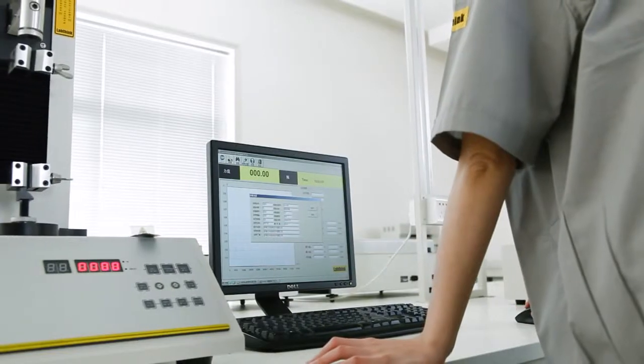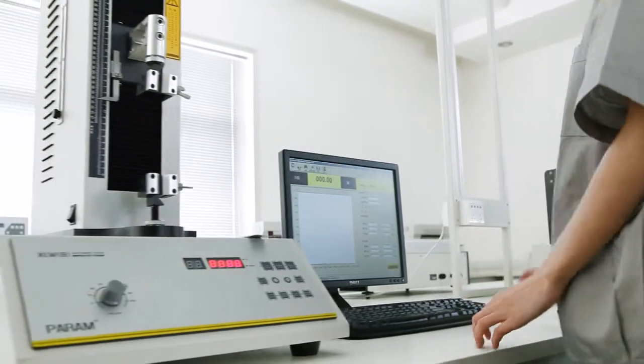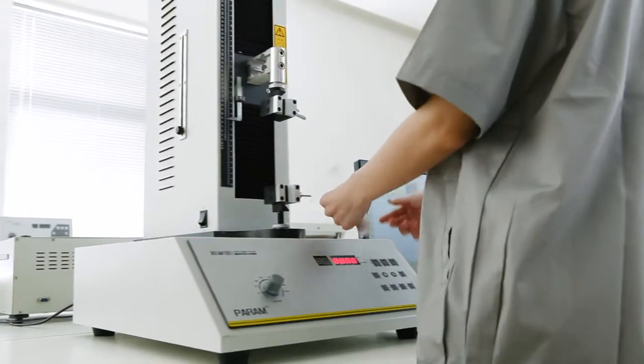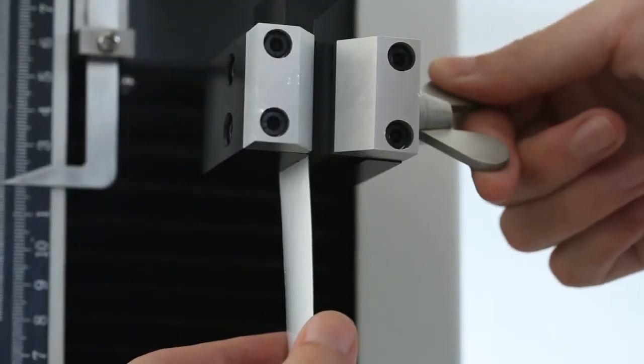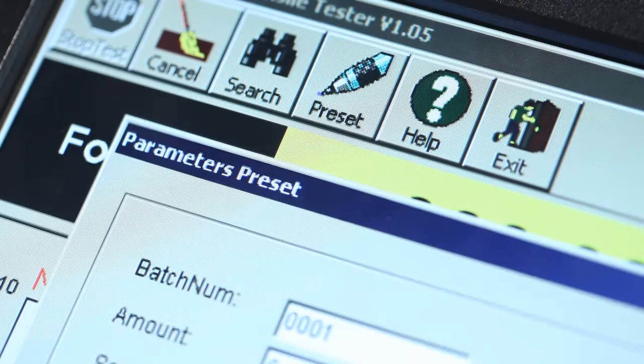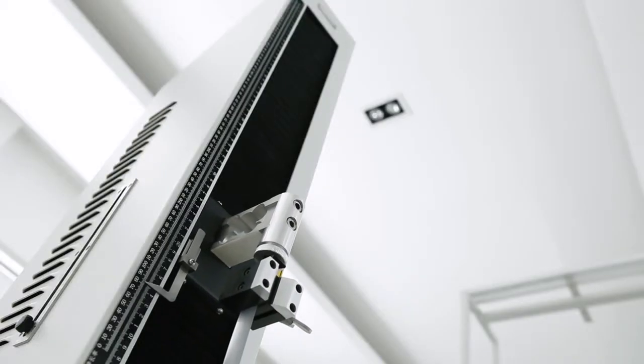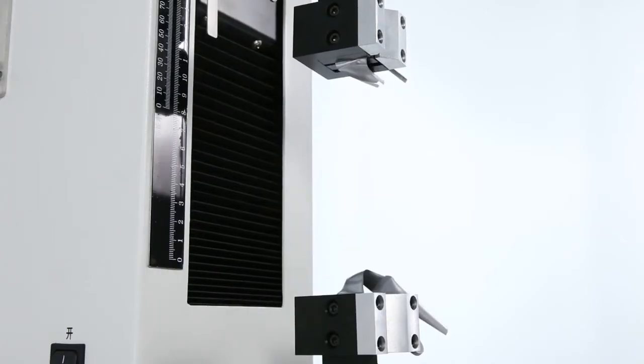Operating the instrument is simple and convenient. Users only need to place the prepared specimen on the fixture, complete the parameter setting, and click on test. It will then accomplish the test automatically.